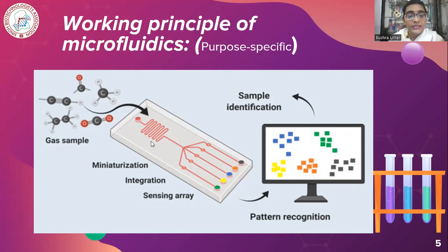Miniaturization means that before introducing the sample, we have to prepare the microfluidic chip with miniature or small channels, like we learned earlier, microchannels. Then integration. The sample we are introducing in the microchannels must be integrated with its reagents properly so that we can get good results. And then the sensing array.